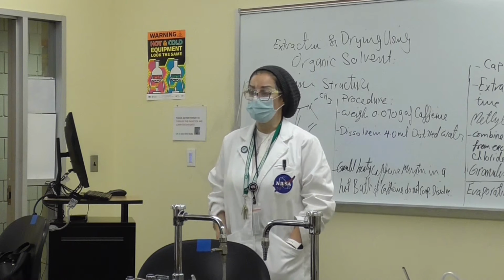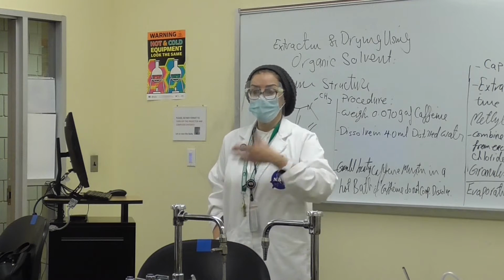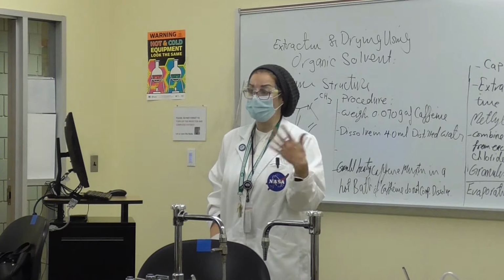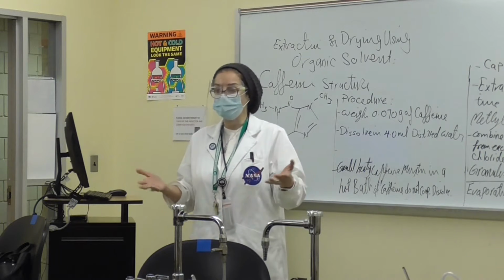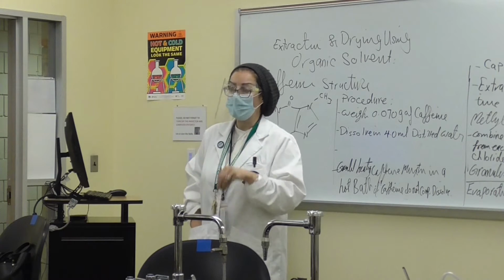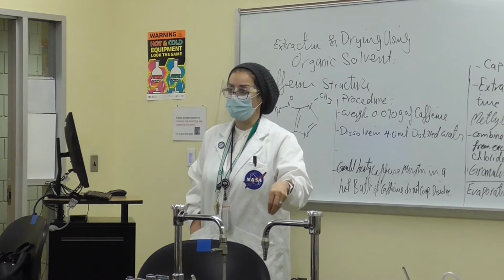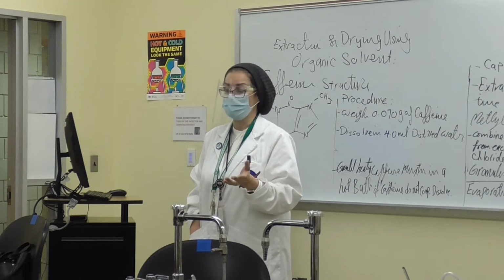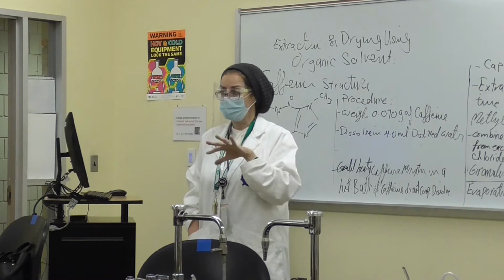What we are trying to do now is, if we have the caffeine in the water layer, we want to extract it to the organic layer, right? This is the whole entire technique that we are using today: to extract the caffeine from the aqueous layer to the organic layer. That's the purpose of our technique today, extraction and drying. Isn't that what it's called?